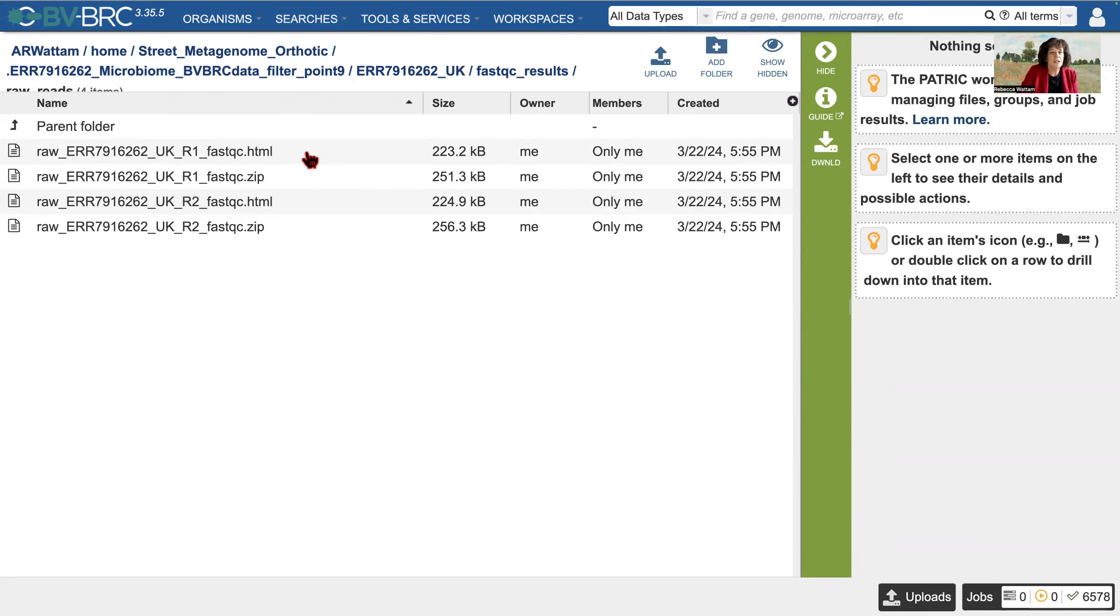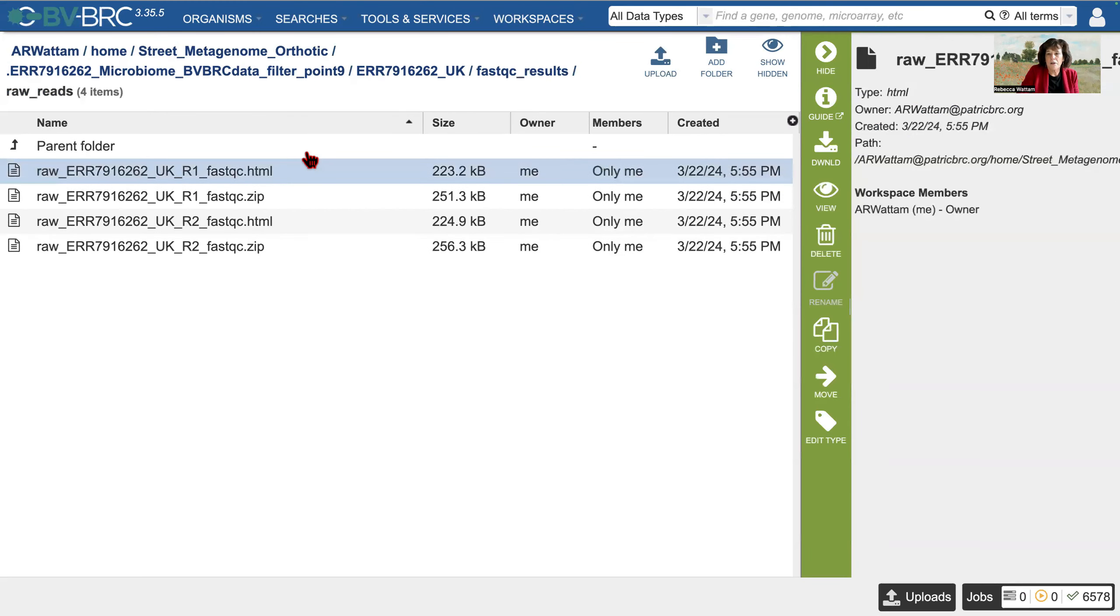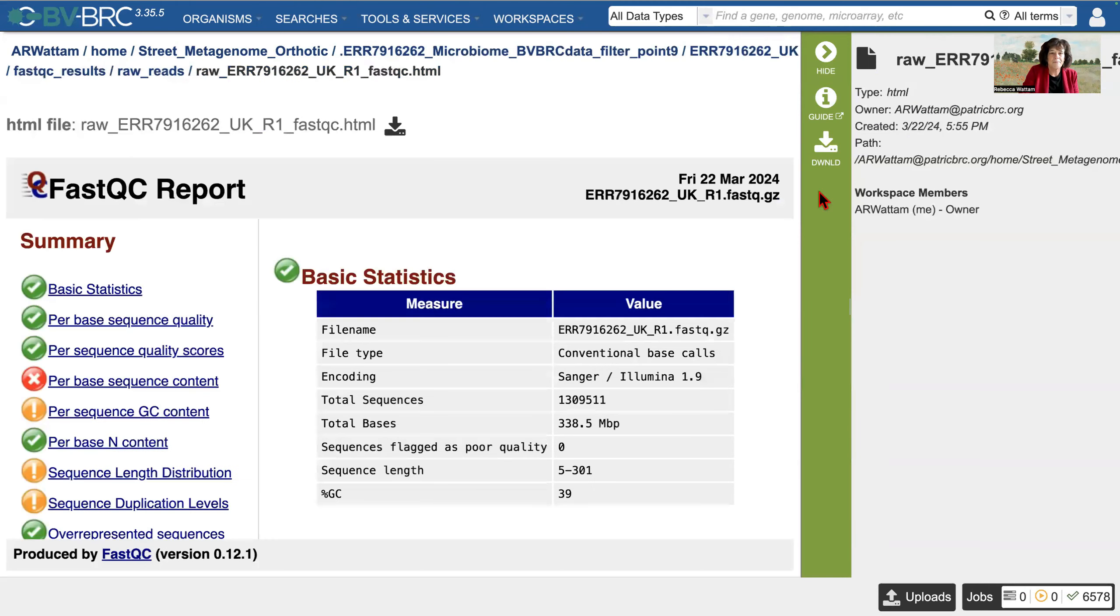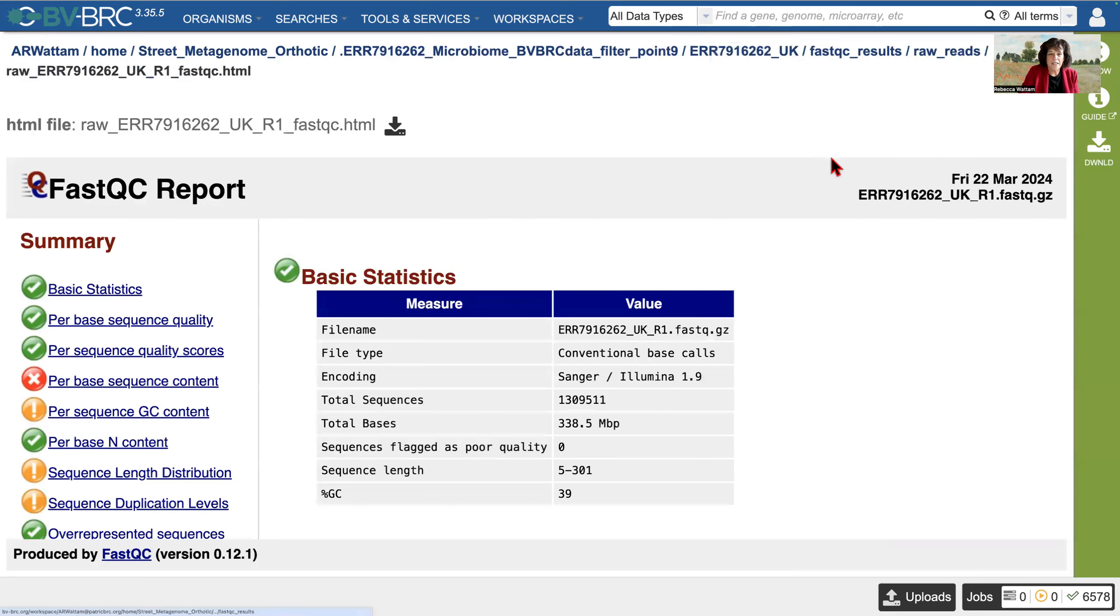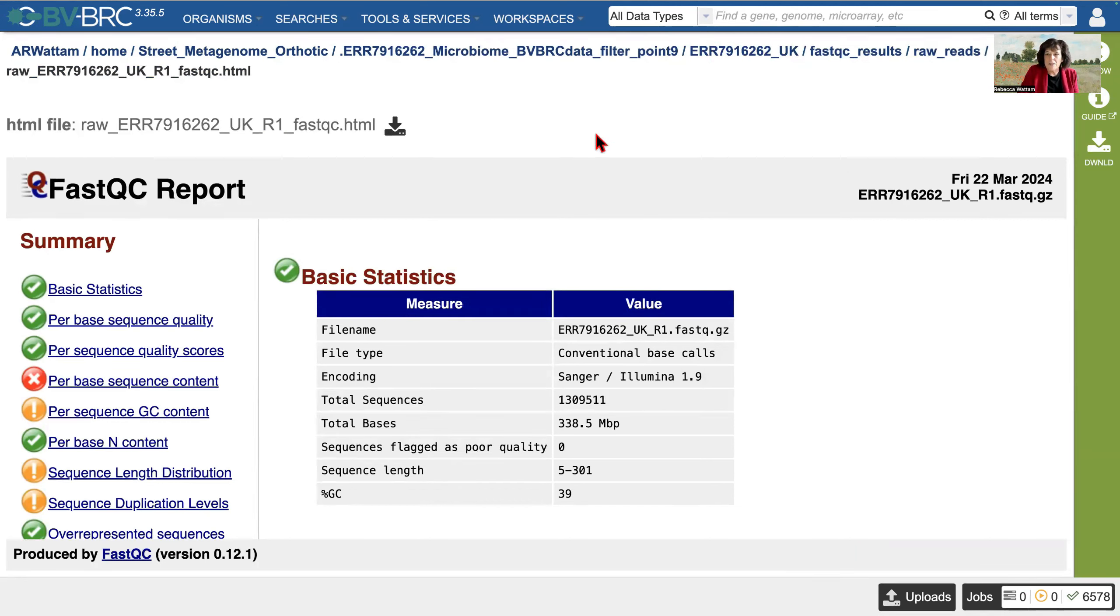But I want to look at the quality of these read files. So I highlight the row, and then I click on the view icon. And I'm going to give us a little more real estate here. This is what pops up. This is a FastQC report.